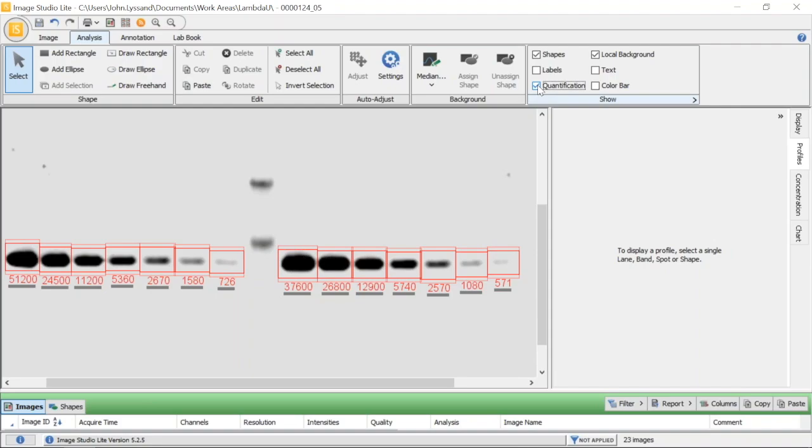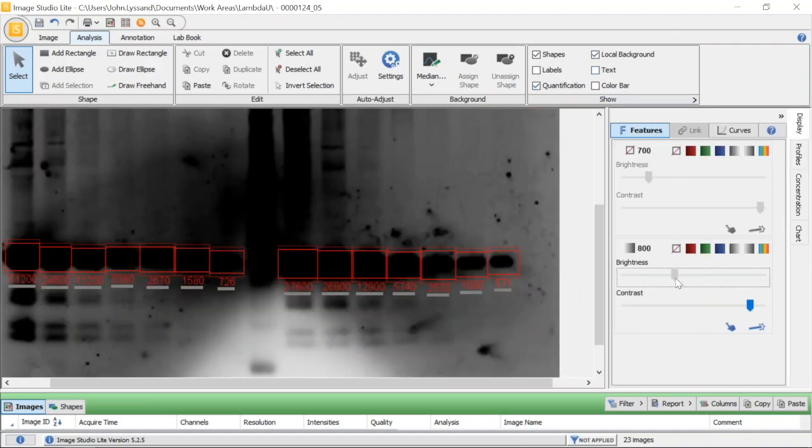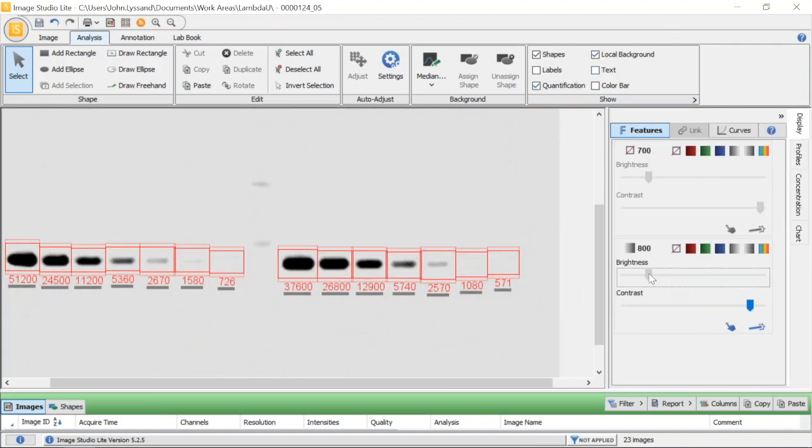In Image Studio software, you don't need to worry. Here, when I go to brightness and contrast and make changes, we can see it has no impact at all on my quantified values. This is because the quantification is independent of these settings, always ensuring accurate quantification.